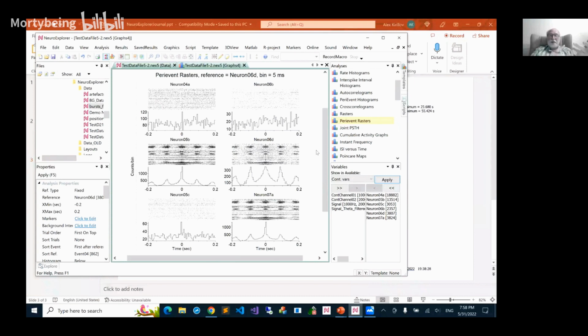Yes, there are regular intervals every 80 milliseconds. Yes, then these intervals are not represented in all the recording. They were in some short time periods actually. That's what we see here. So these are the periods of overall activity.